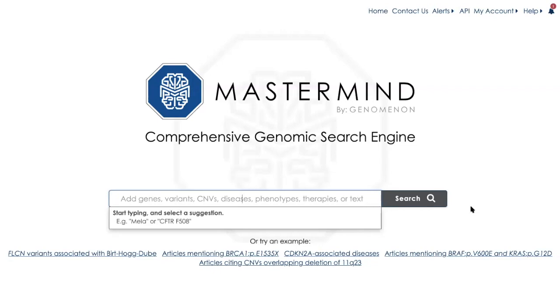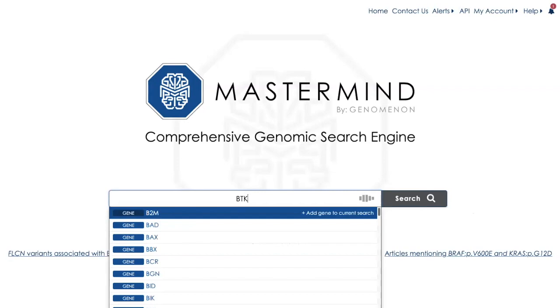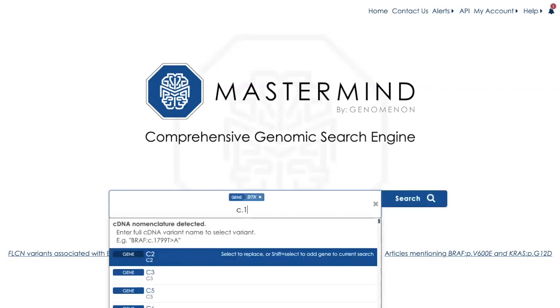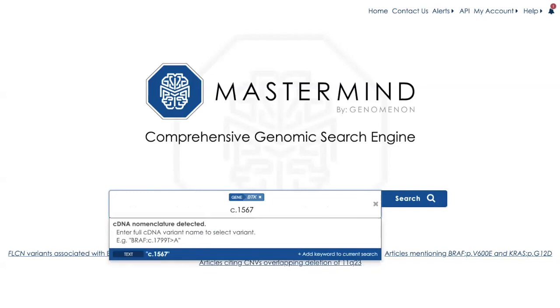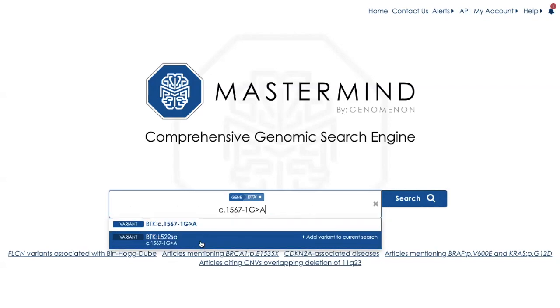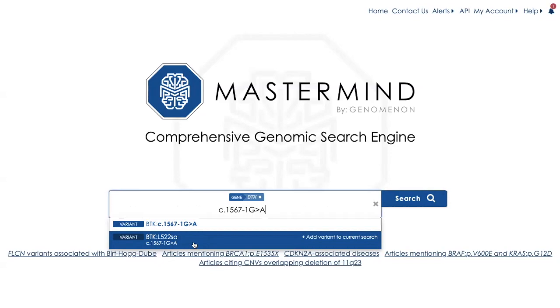We're going to demonstrate intronic search with this example. We're going to search the gene BTK, and then we're going to add a cDNA position. You see that this is populated with my variant that I entered. However, what I want in order to maximize the sensitivity of my search is to be able to find all of the different nomenclatures that could represent this variant.